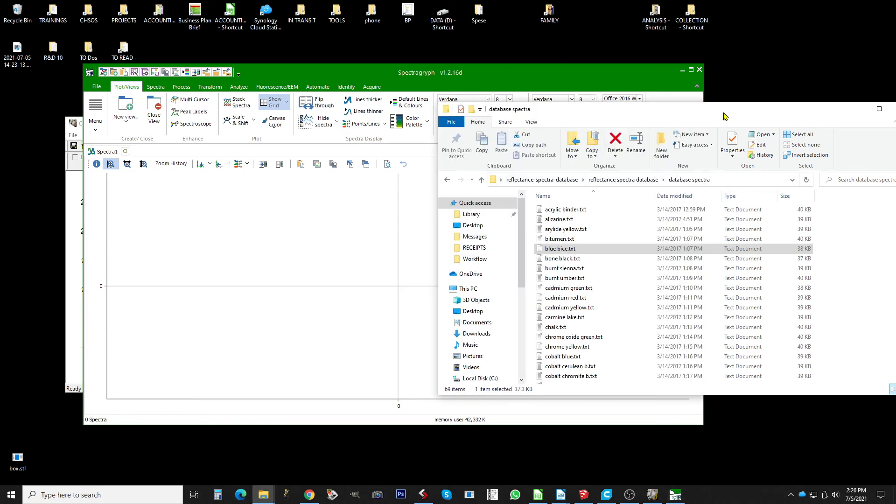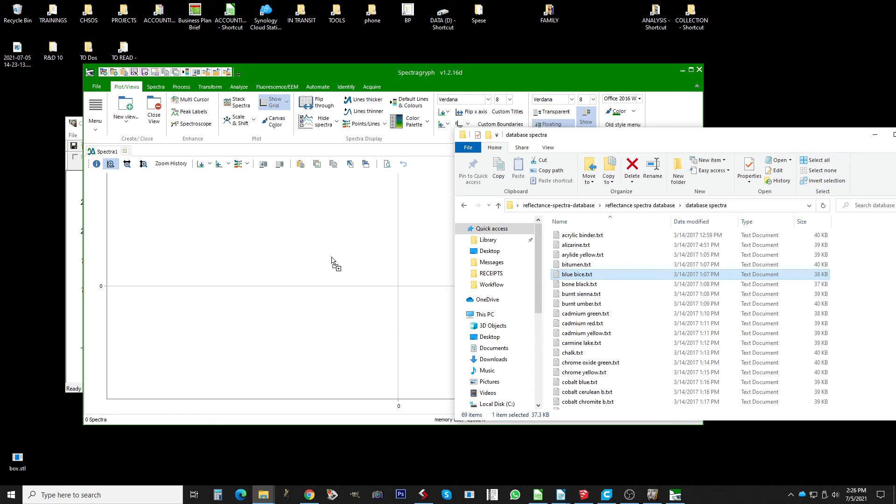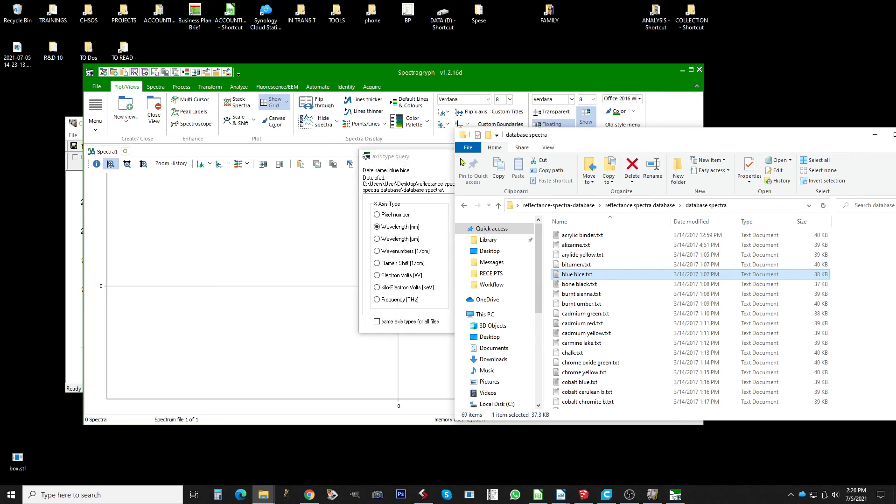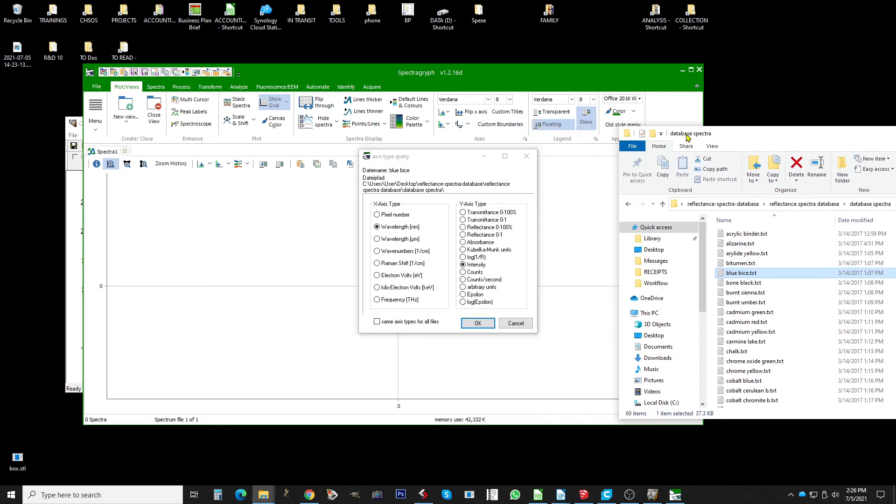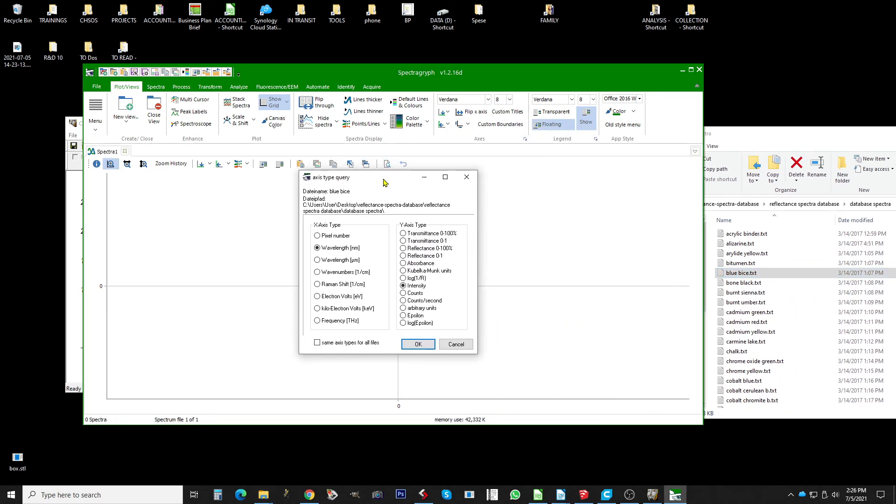For example here you have a blue bice in our database. You just need to drag and drop and there is this window where basically the software is trying to figure out what kind of a spectroscopy is uploaded.